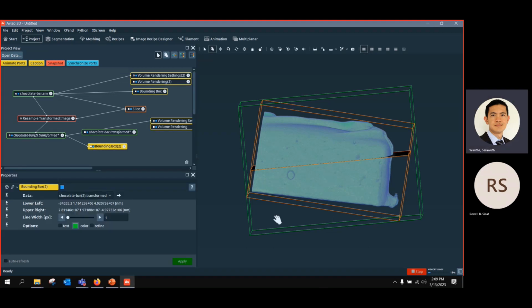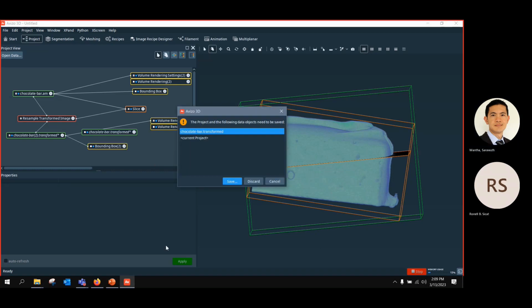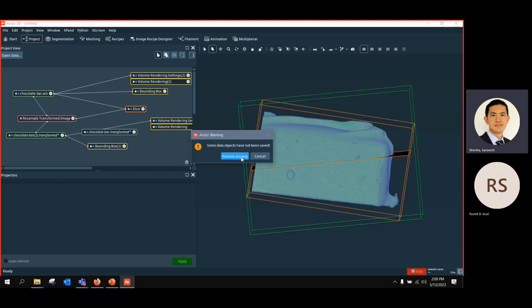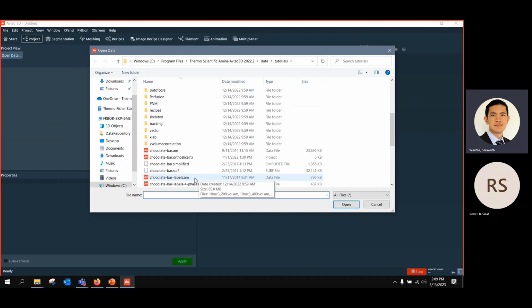I just wanted to ask about the animation. So give me 10 minutes, the animation is really pretty easy. Sorry, I totally didn't look at the full program. So yeah, animation. Sorry for this. I will just open the chocolate bar again to create animation.